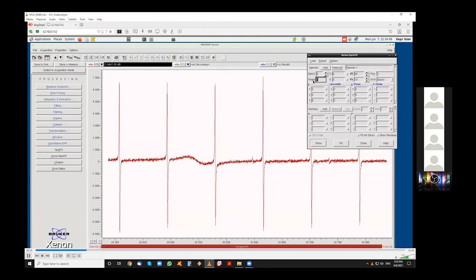And we will start our simulation by changing the spin number with the right values. For our first try in this simulation, we will choose the G value very close to the G value of the free electron. Here you're not seeing the measurements done on the line width, but it's something that I already did before recording this.